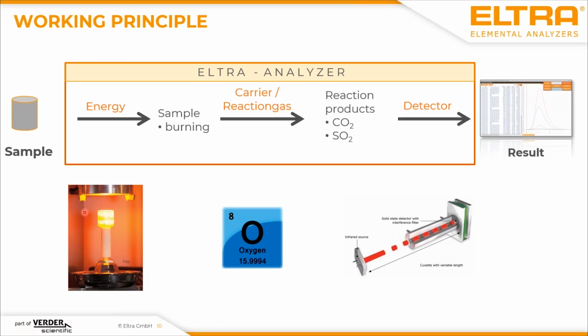This is very important to get a high temperature, first because you want to combust the sample, and you need a certain temperature to combust. And on the other hand, you also want to melt the sample, because it's very important that the sample not only burns on the surface, but that the whole sample melts. And then afterwards, when it's melted, that then the burning process starts, or at the same time. But it is very, very important that the sample will melt during the burning process.